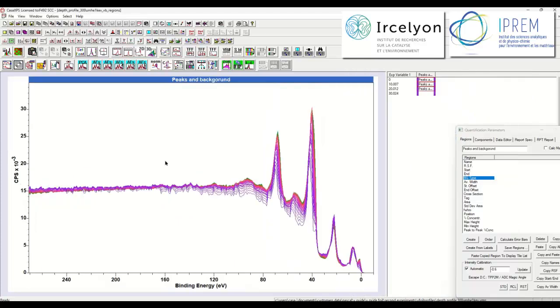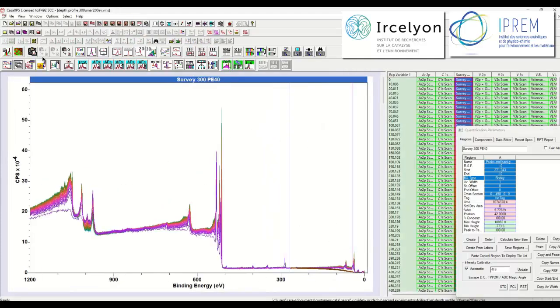So I have now performed that, and overlaying in the active tile, which we already have, that shows that we've got all of the same regions set up on all of the survey measurements from this second experiment. I'll rename the region to be argon. I'll propagate the names.